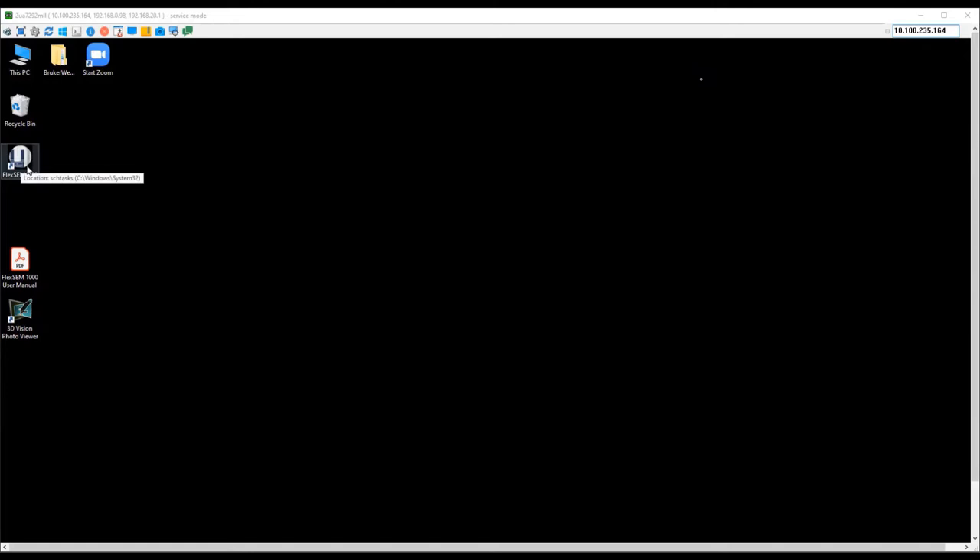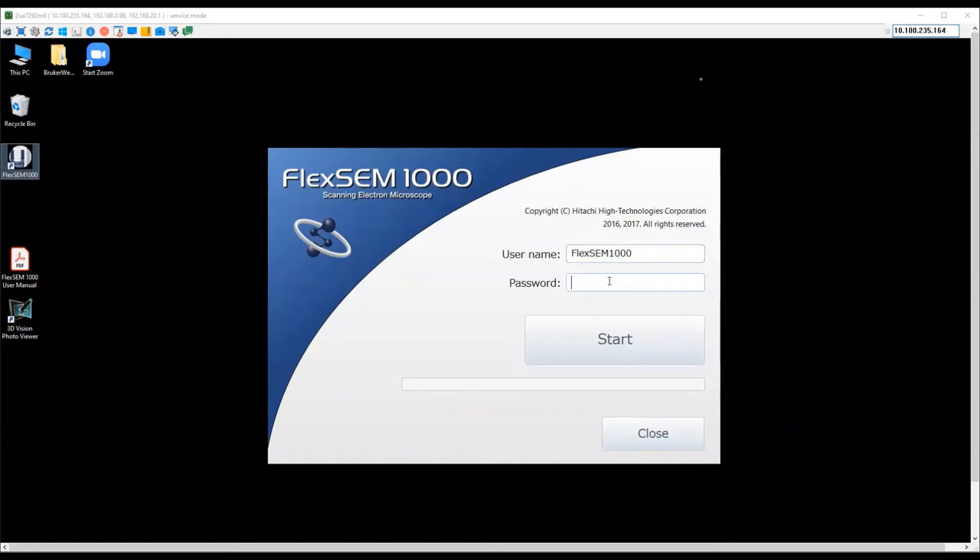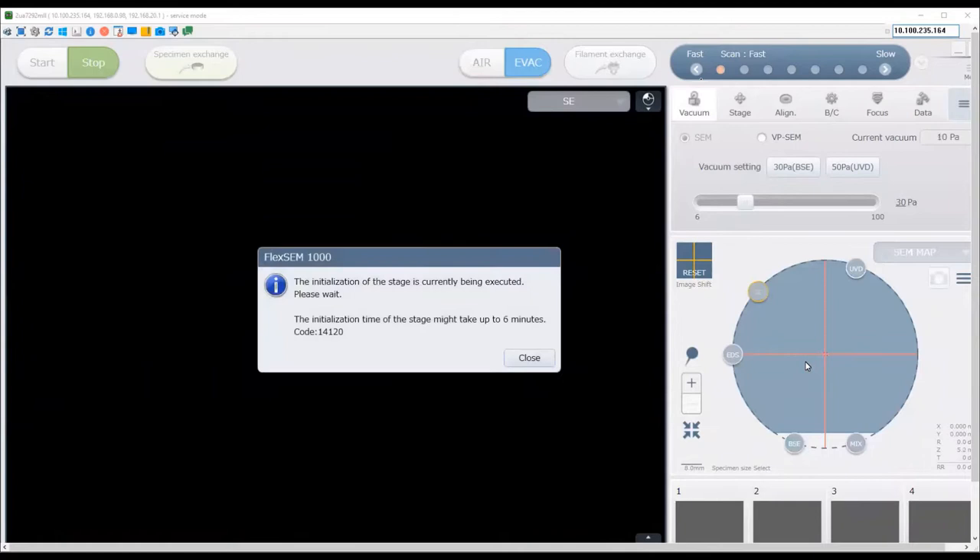Next, open the FlexM 1000 software by double clicking on the icon. Give it a few seconds to start up — you should see a splash screen. The username is FlexM 1000, there is no password, so just click start. This brings up the user interface.